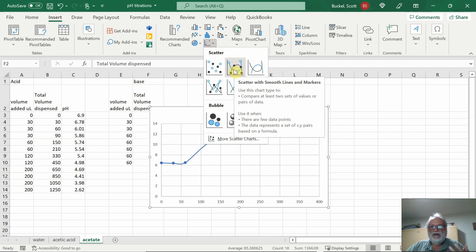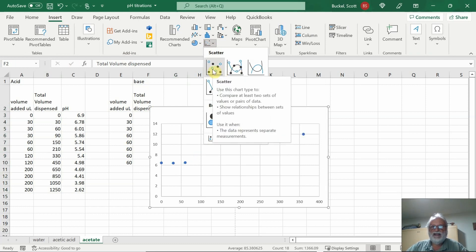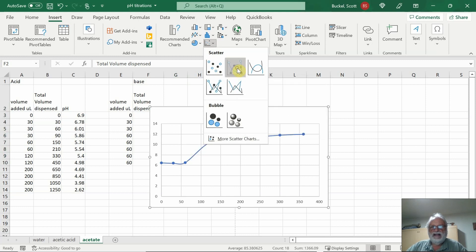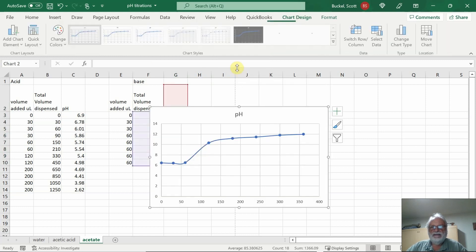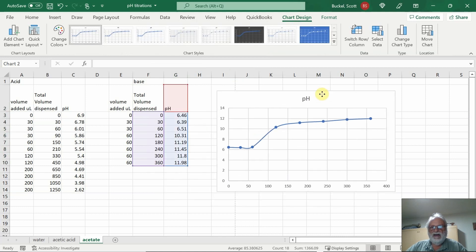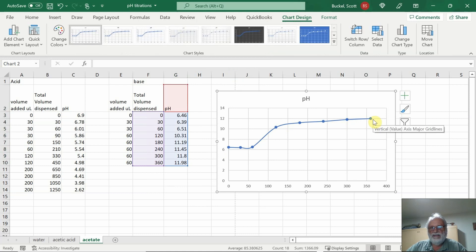Frequently, when I'm doing standard curves and things like that, I will go ahead and adjust the points. But here for this, I'll go ahead and enter this one. And you see, I have a curve here that comes out. It's kind of stable. There's a pH change, and it stabilizes again as it approaches 12.